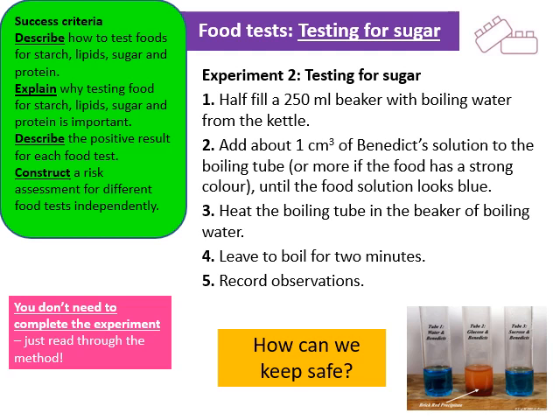So we're moving on now then, and we're going to look at the test for sugar. This one's a slightly shorter method. Again, we are not carrying out this practical. You just need to read through the method, make sure you're happy with exactly what we're doing, and consider any potential hazards or risks that we might need to think about to make sure that we can keep safe.